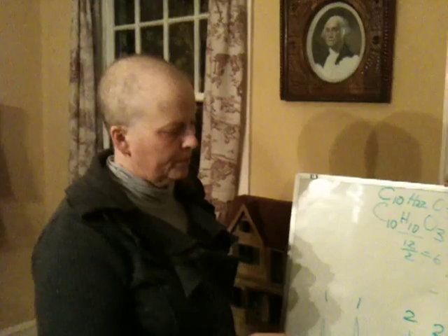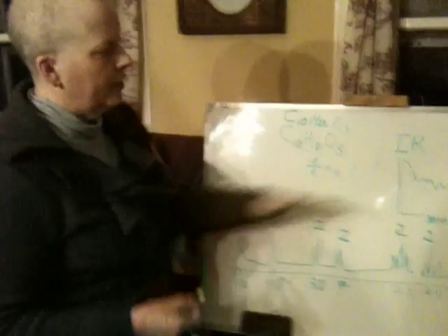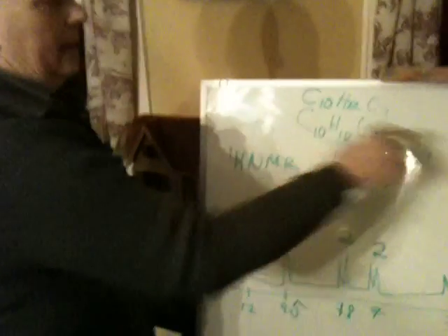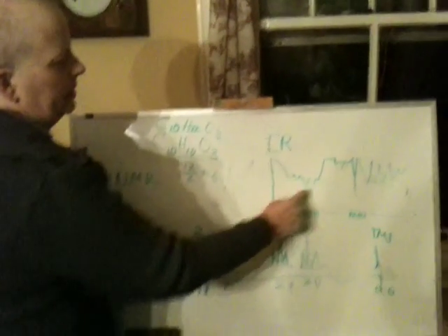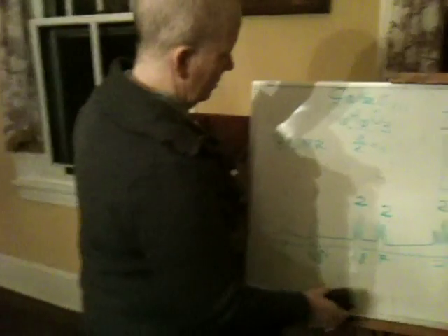But we're going to interpret the NMR very rigorously and then look back at that IR and see what that means. You will very frequently be given both a 1H NMR and an IR. Now again, these are my drawings. So again, think about what that means. This is the most important thing I want you to get out of here: a very broad peak at around 3,000. Okay? So let's interpret the NMR.